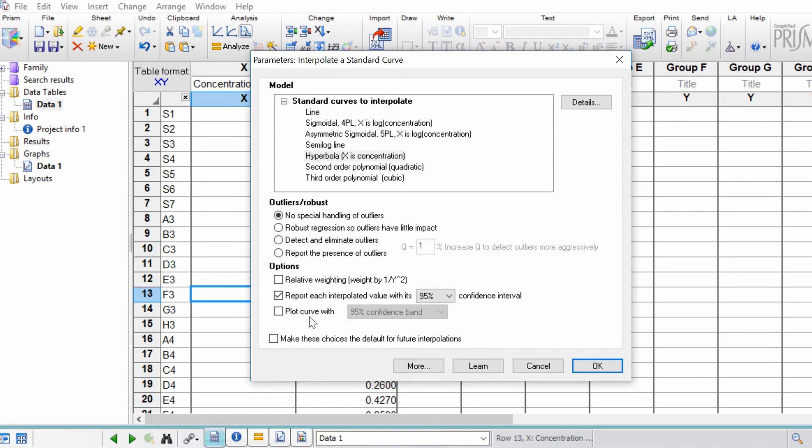An important thing that we need to make sure that we are ticking is the report each interpolated value with its 95% confidence interval. So this means GraphPad will return the concentrations for our unknown samples based on our standard curve. And with that you want to click OK.